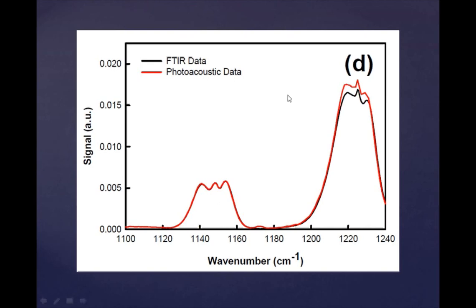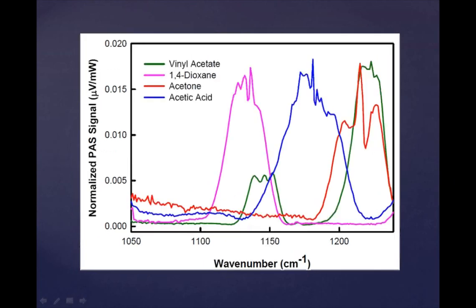Also, you see a Fourier transform is used to process the data. This figure shows each of the four spectra in the experiment superimposed on each other. Notice that they all have distinct features. The researchers developed MEMS that could differentiate and separate the spectra all at once. The photoacoustic signal is additive, and the computer recognizes the distinct features from each of the substances in its library to decide exactly how much of each analyte is present.